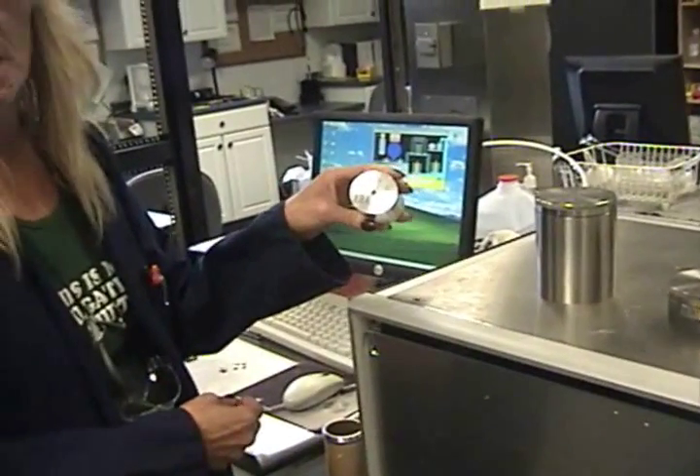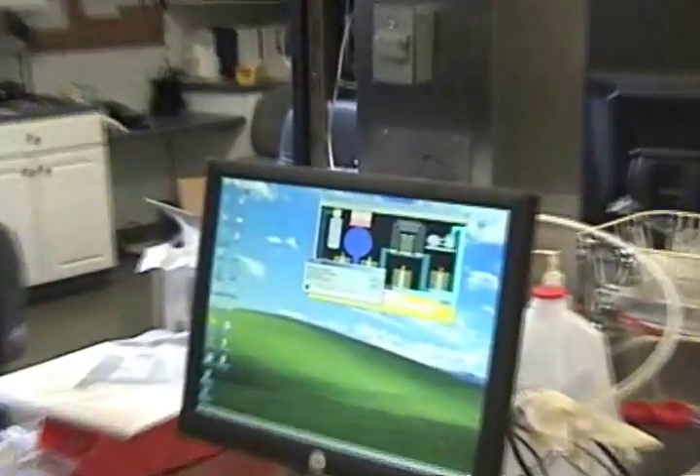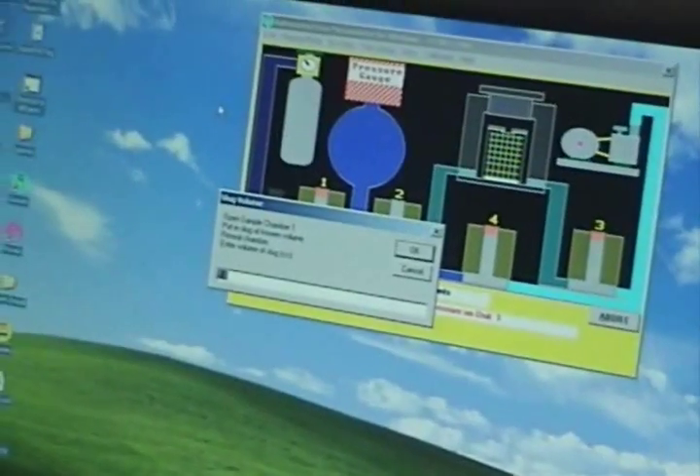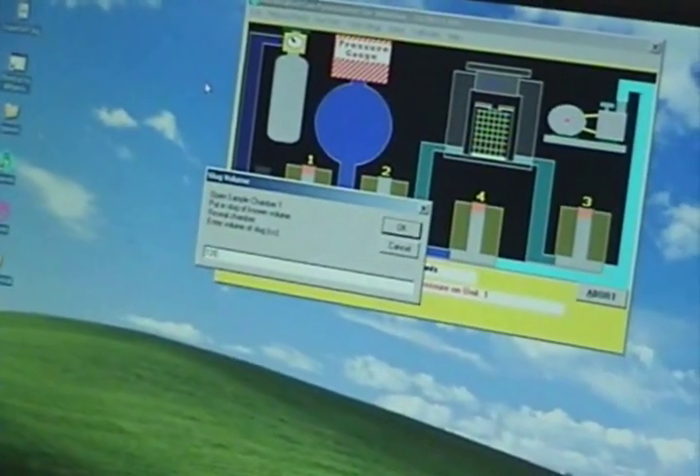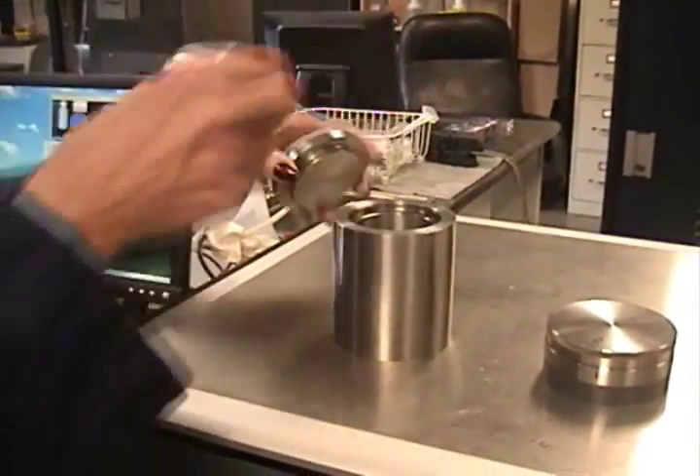This is the volume of a known slug. Right here, it's asking you to enter the volume of the slug. Just unscrew the chamber and set it right in.